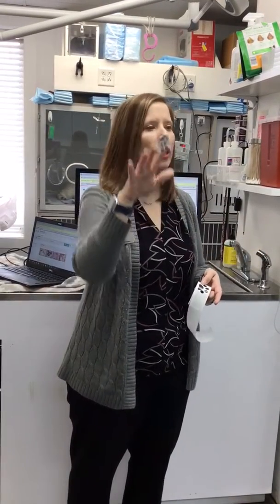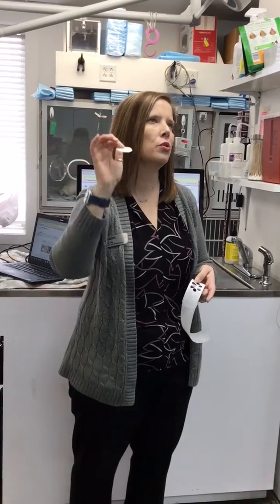All right, for a sticker, okay? You know how you say add test, you could pick the set of you, and then it asks you, like, if you want to append the results, merge and replace, add new, or escape or something like that. Y'all seen that, right? Yeah.